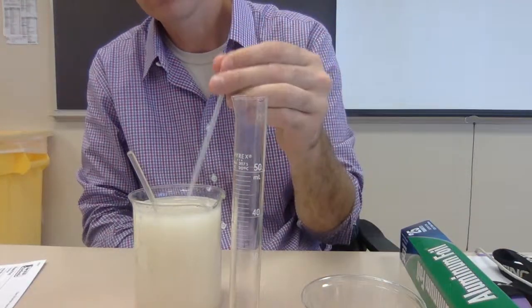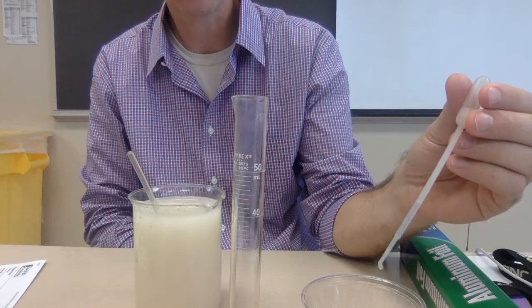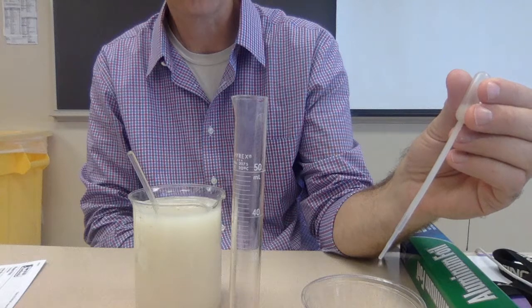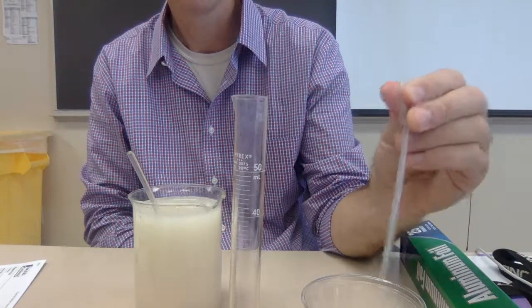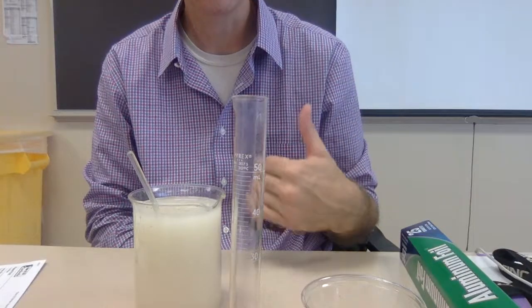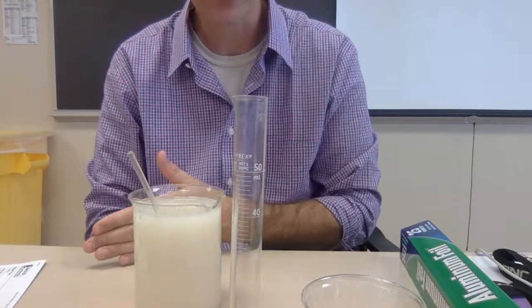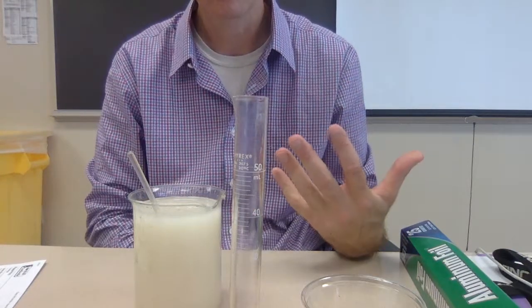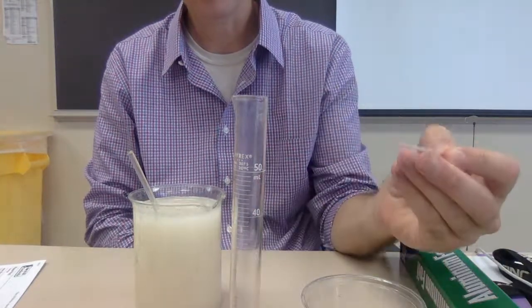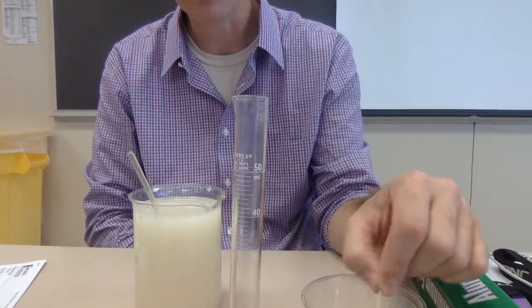Then you'll take some with your eyedropper, and you're going to put 25 drops into the grape juice. Okay, so that's going to make a grape juice yeast solution. We use 25 drops because that equals 1 milliliter plus 19 milliliters of grape juice gives you 20 total. You're going to take a toothpick. You're going to stir that up really, really well to make sure we get a good mixture.